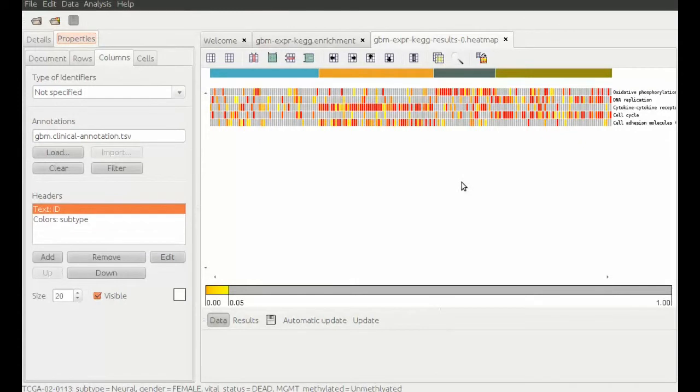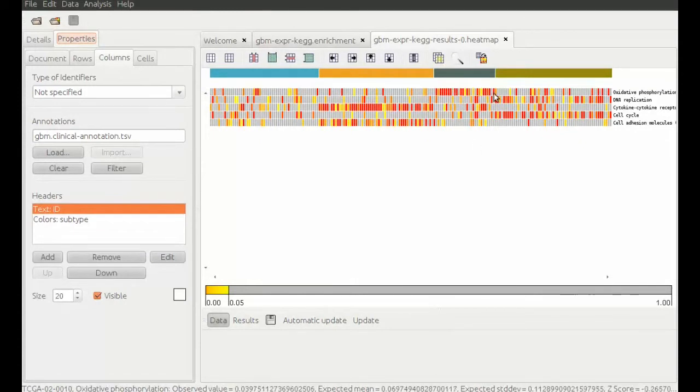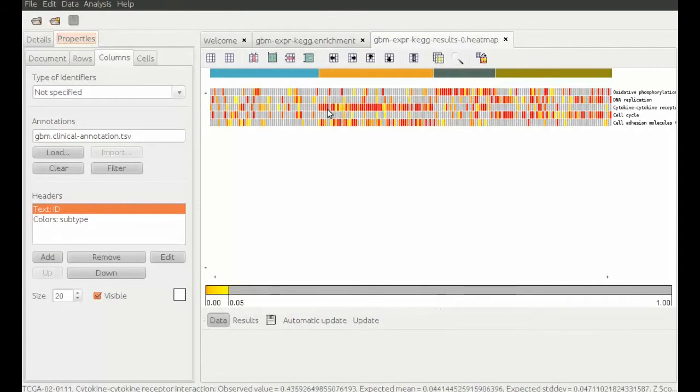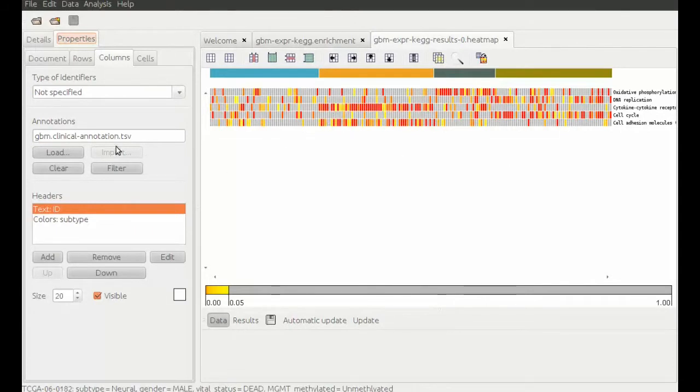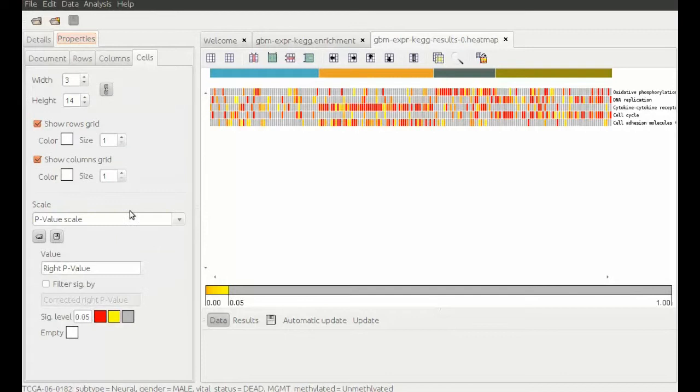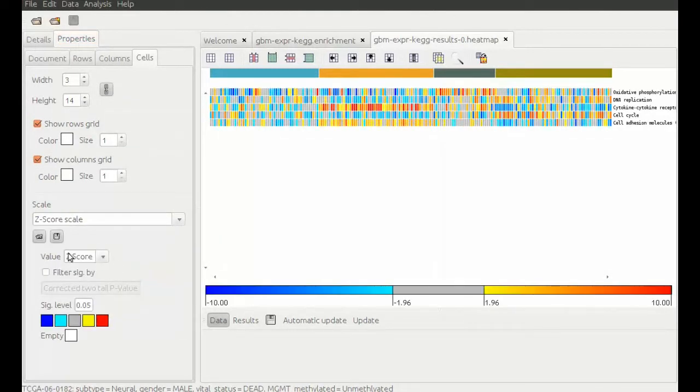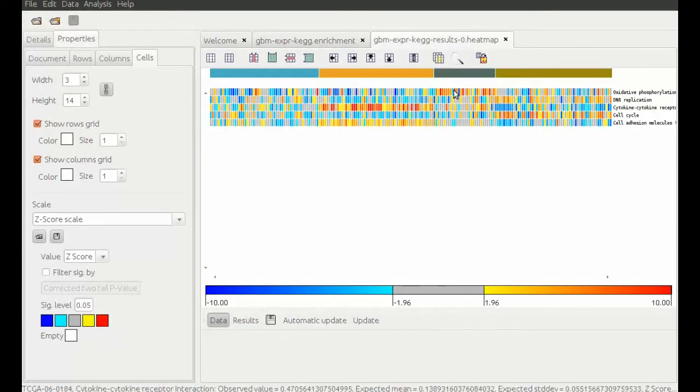But still, we cannot tell the difference between over and under expressed pathways. Therefore, we choose to display z-score values. Thus we can see in red over and in blue under expressed pathways.